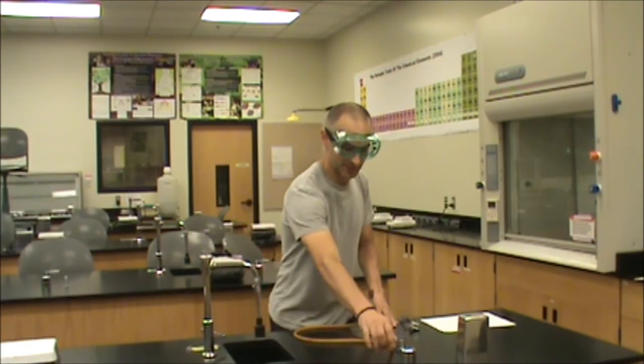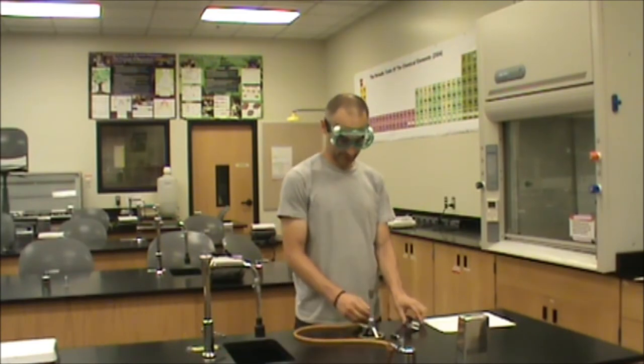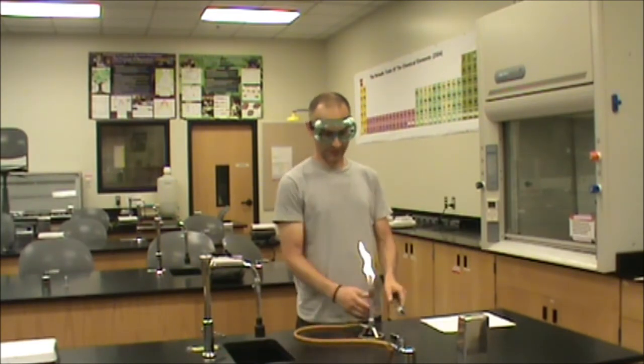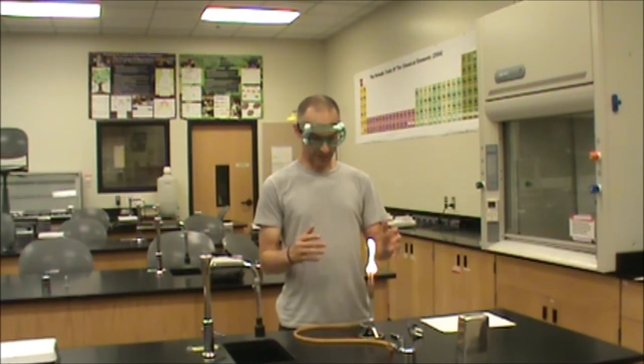An alarming situation that you might encounter is if you ignite the Bunsen burner and the air supply has been turned off. If we turn on the gas and ignite the Bunsen burner, we see that we have this very large, bright orange flame.